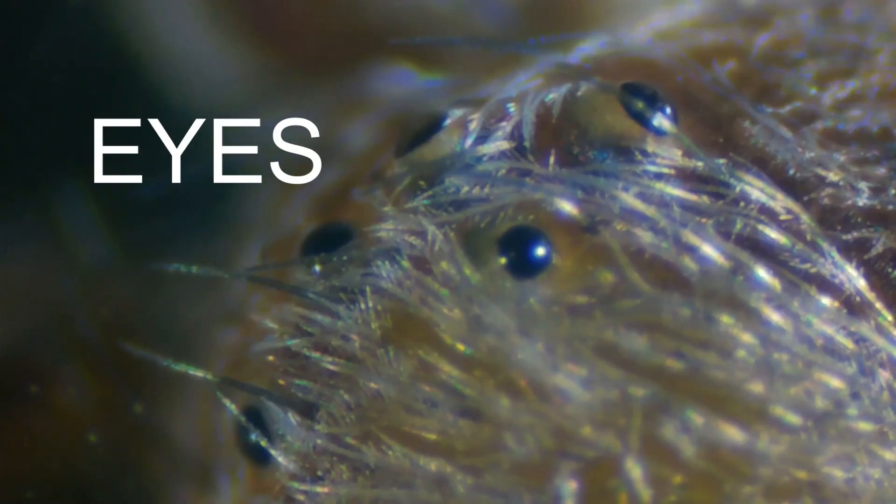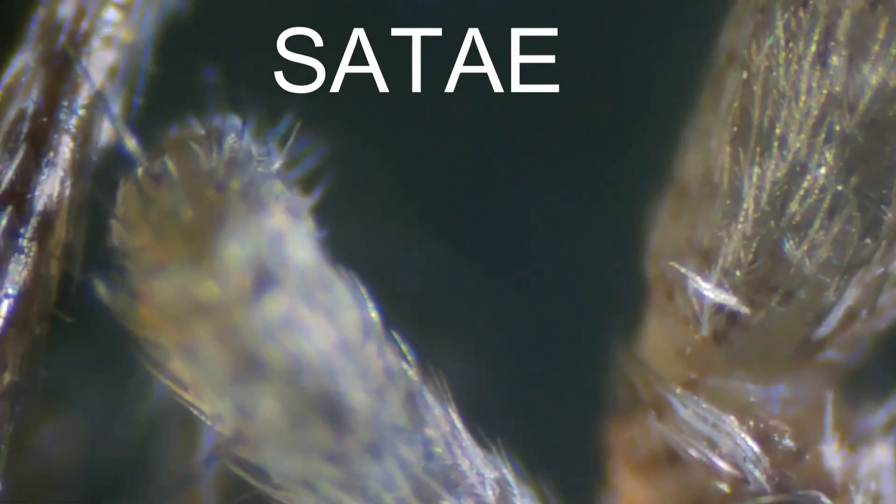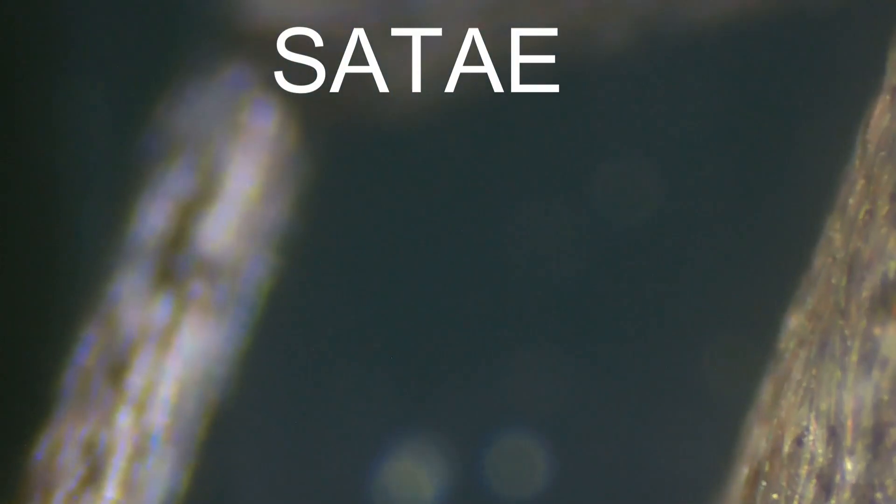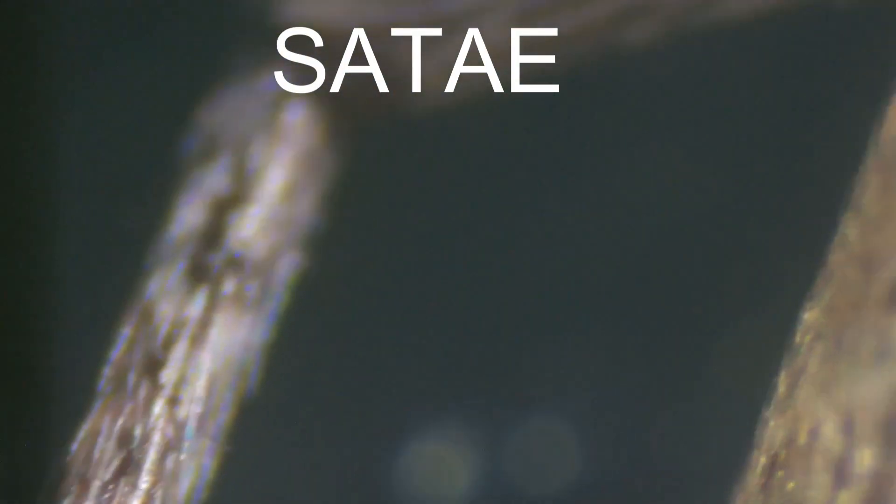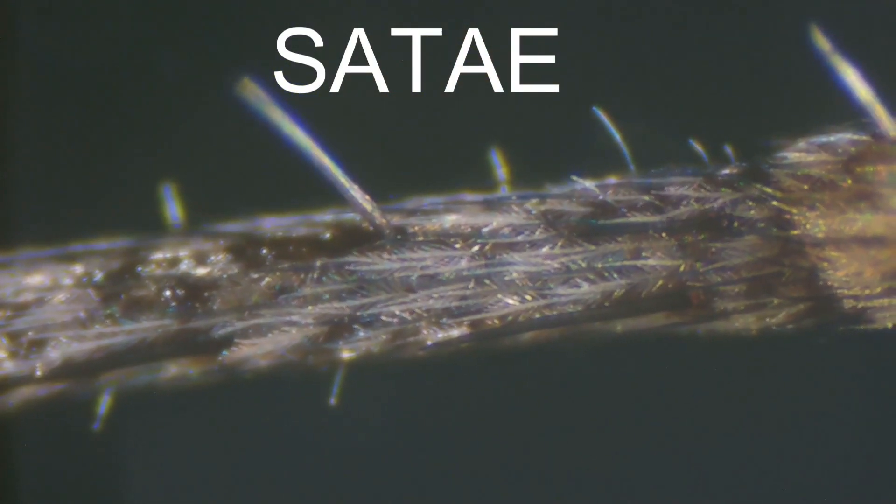It's a superpower that allows the spider to detect the approach of even the smallest insects. But look even closer, and you'll notice tiny claws at the tips of these legs. Perfect for gripping its silken web, walking upside down, and manipulating its prey.